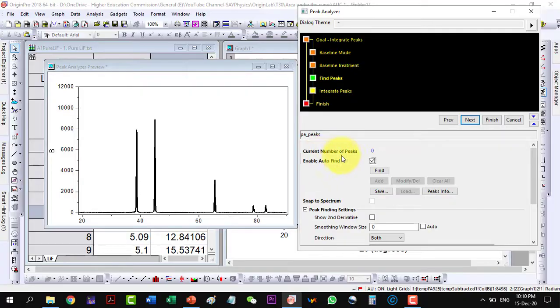It is saying that currently the number of peaks are zero. So I will have to find the peaks with the auto-find, and here they are. So it has found three peaks, as they are having the most of the contribution from these three peaks, while these two peaks are not auto-found. So I can find them manually, but let's go on with these three peaks, and I go Next.